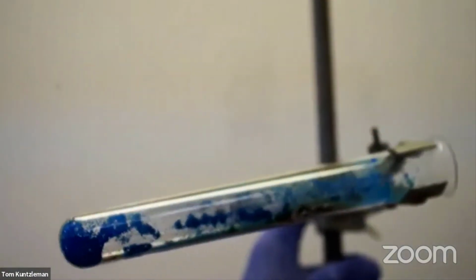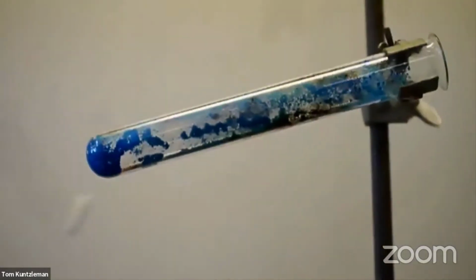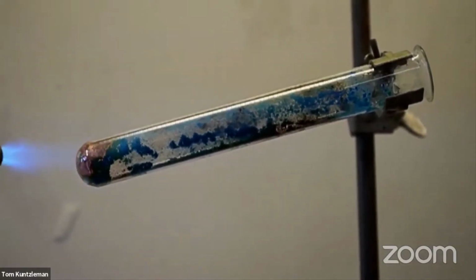Here, let's heat this side. Look at the side that I did not heat. It's still kind of blue. Let's heat this side so we can get this to go copper metal. Oh, that's so pretty.